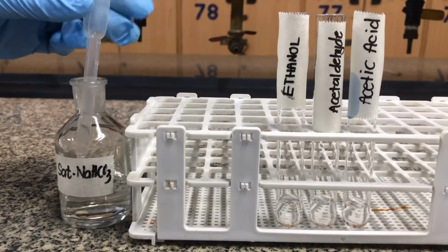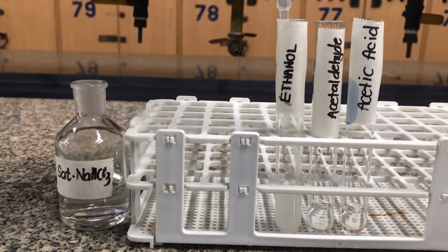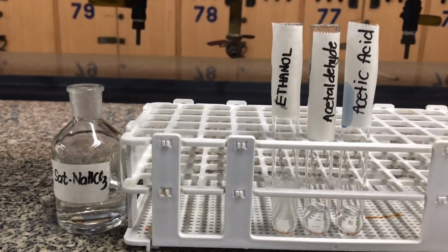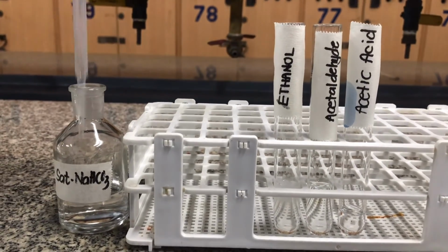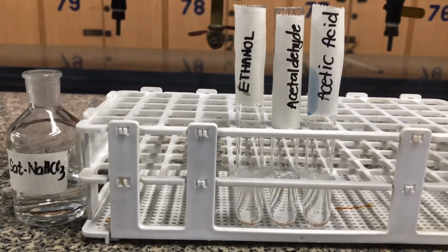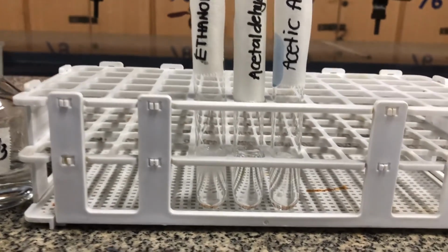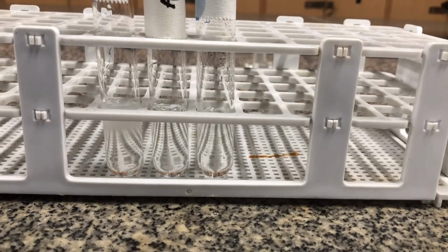This test is conducted by adding 1 ml of saturated sodium bicarbonate solution into each test tube containing 1 ml of ethanol, acetaldehyde, and acetic acid respectively. The formation of effervescence or bubbling indicates a positive result, which shows that carbon dioxide was produced. This result is shown in the reaction between the bicarbonate ions and acetic acid.